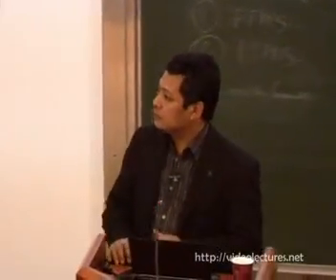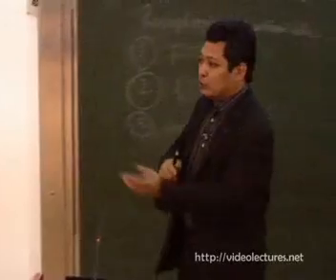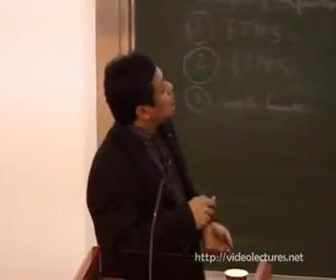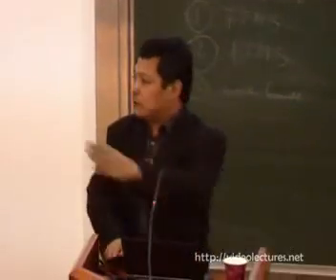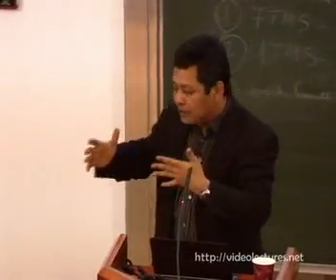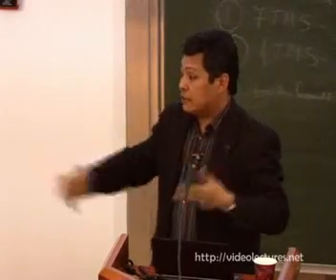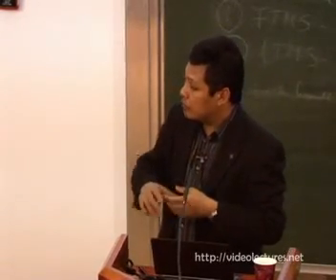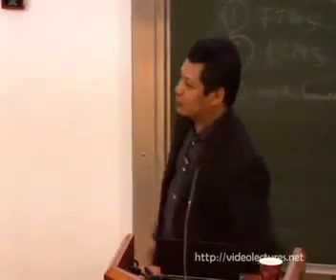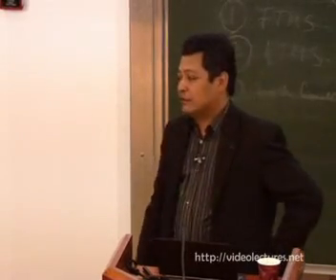How is energy dissipated in this process? That's a very good question. We wanted to find out. It should stop at one point, so we can calculate. But it turns out that we cannot find a stopping point. It always goes and sticks somewhere else, because the best prepared surface free of defects is only about 30 nanometers, about 300 angstrom, of clean area. And the molecule easily goes. It's almost a ballistic type of movement.